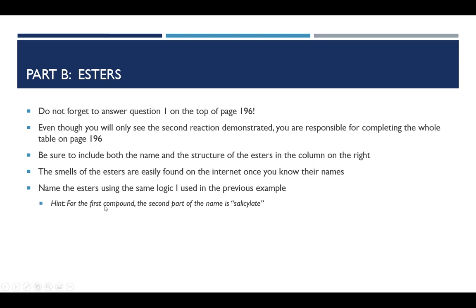The first compound might also be tricky on that list. The second, it was salicylic acid. So the second part of the name for the first compound is salicylate. So it will be something salicylate. Let's go ahead and take a look at a video of this reaction being performed.